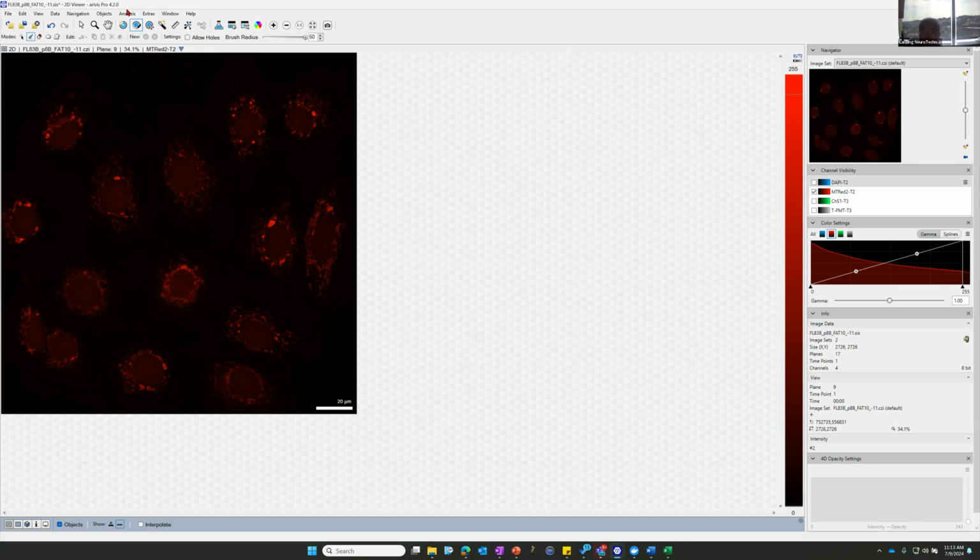So when we do the machine training you just did in Arivis, will the result be the same as if we do the same thing in CellPose? I don't think it would be. The reason is that the machine learning trainer uses a random forest algorithm, and it's essentially just a really nice pixel classifier, but it doesn't have any concept of shape. It can't learn shapes of objects, whereas CellPose is a deep learning model. It has been trained on tens of thousands of images, fluorescent images, regular everyday images. And it'll tell you what those models are trained on, but it does have a concept of shapes.